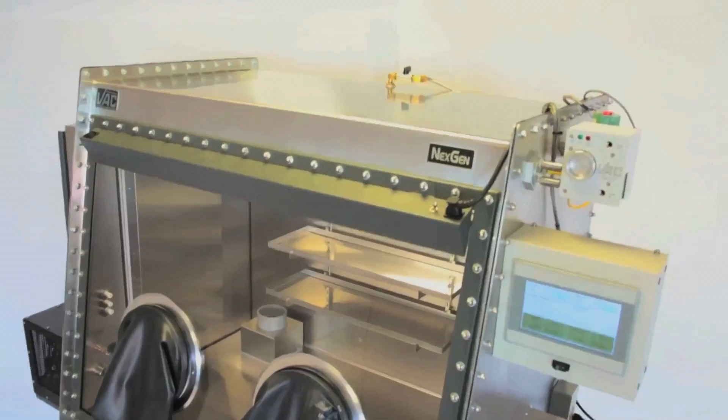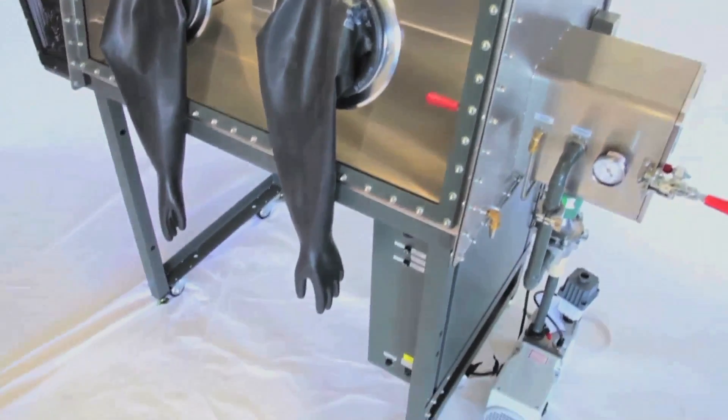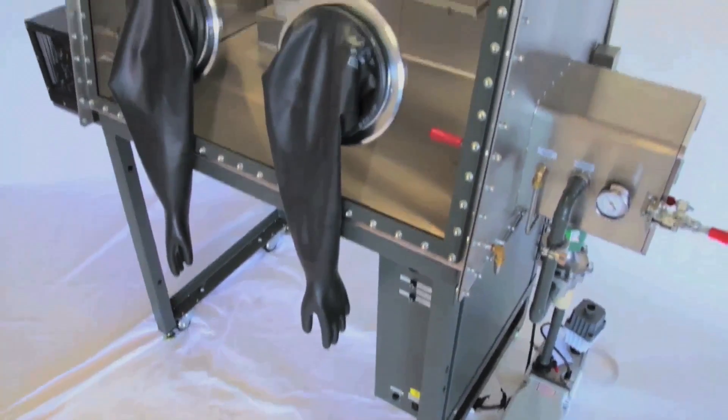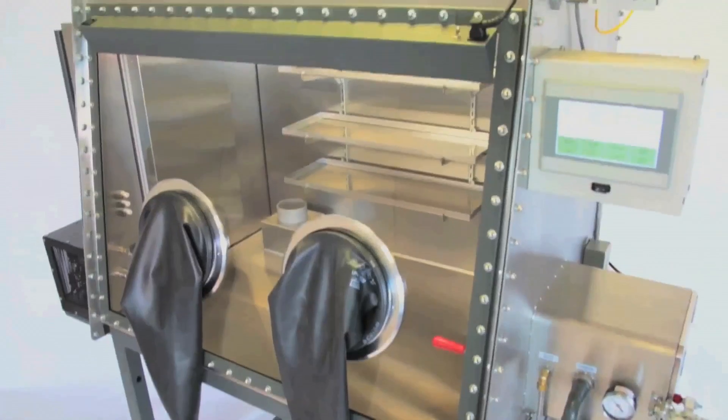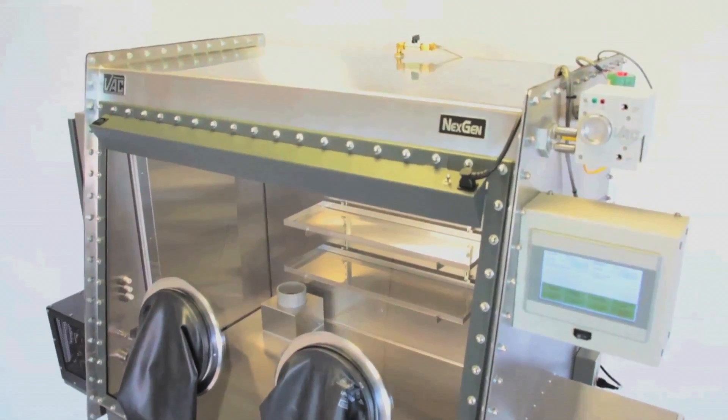The NextGen is much simpler than traditional systems since all of the external plumbing has been eliminated. No external purifier plumbing or regeneration valves means there is a dramatically reduced potential for leaks in the system.